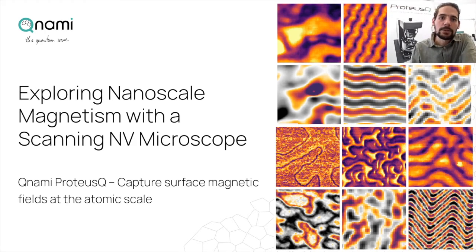Qnami is a startup that is based in Switzerland and was founded as a spin-off from the Maletinsky lab at the University of Basel. The talk will be about exploring nanoscale magnetism using a scanning NV microscope.